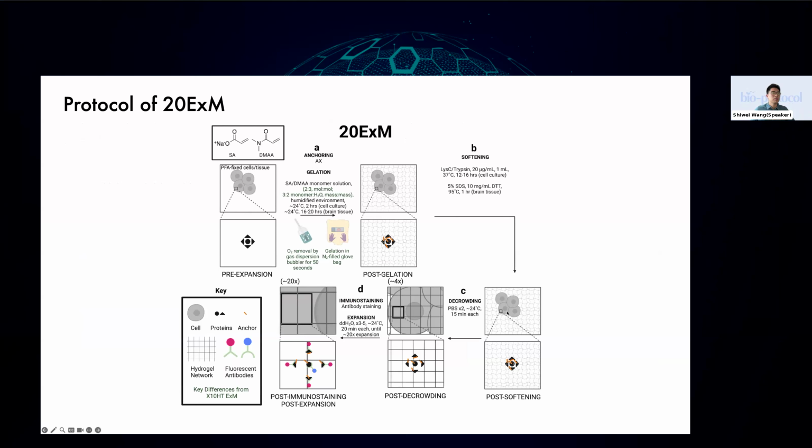And we'll put the tissue in PBS. And at this step, we already expect the tissue to expand around 4-fold to 6-fold. And that creates space around the targets for the next round of antibody staining to occur. And finally, you expand in water to reach full expansion, and then you can perform imaging on a microscope, such as a spinning disc confocal.